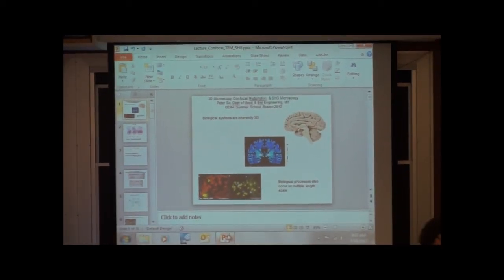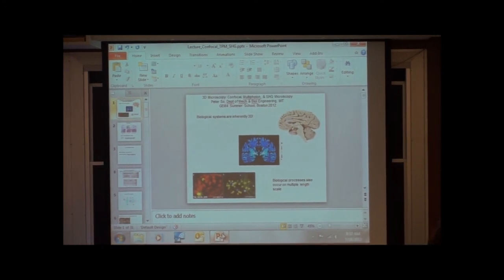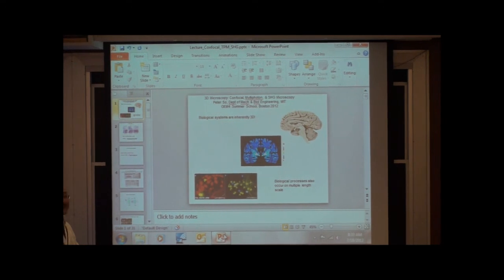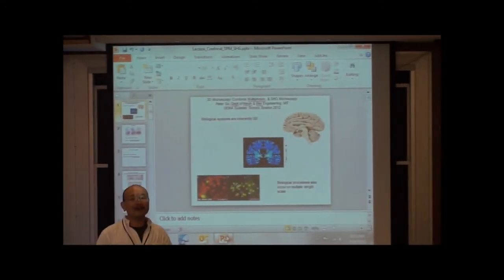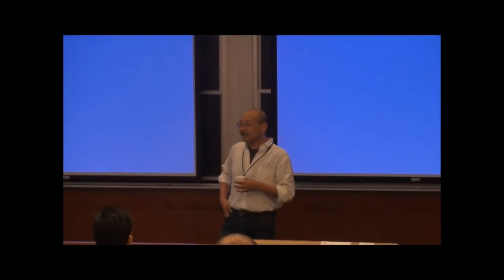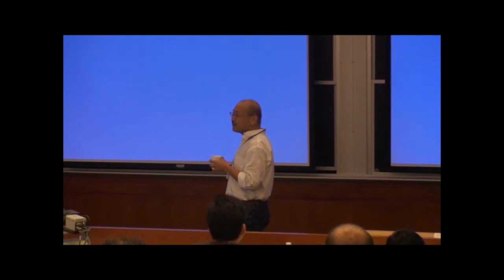Today I want to tell you, everyone has built a microscope. You are pretty much done. And you have seen that your microscope, although it's relatively easy to build and relatively cheap, works reasonably well. And you see that you can image, for example, some of the dendrites of the neurons that Bill and Seb created for you, and some of you grew.